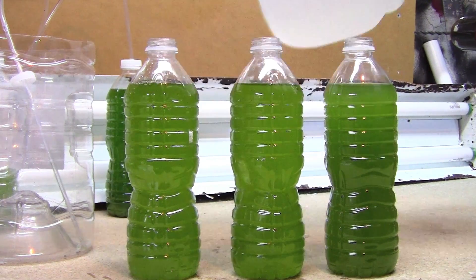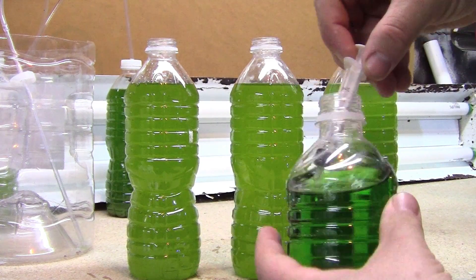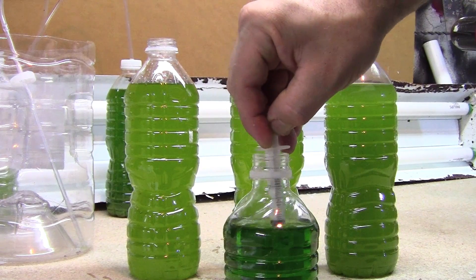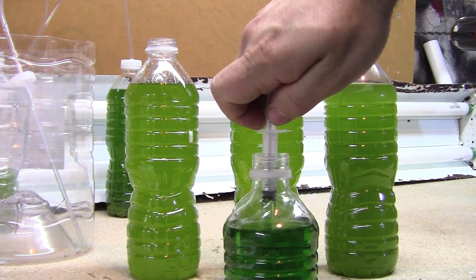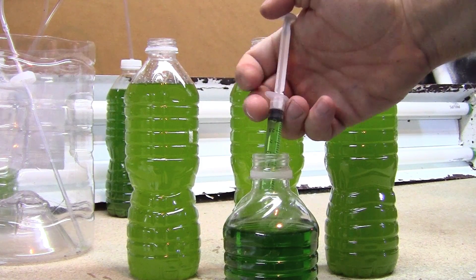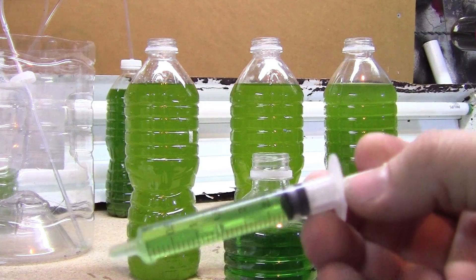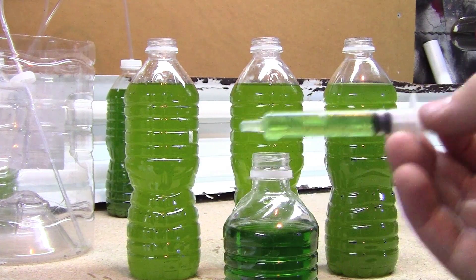Right here I'm topping them all off and now you need a fuel source for your phytoplankton. This is F2. You can get it online from a lot of different vendors. I have heard of hobbyists using Miracle-Gro, which I guess they've had a lot of success with.